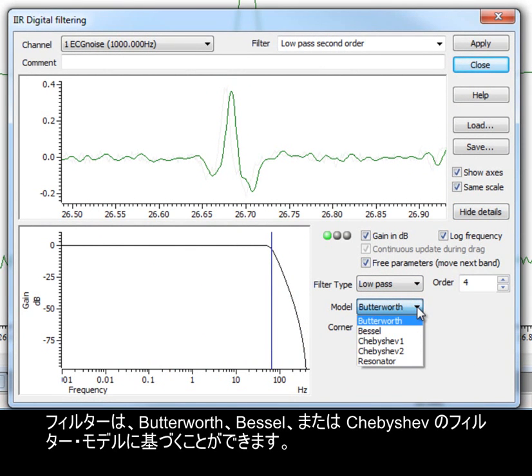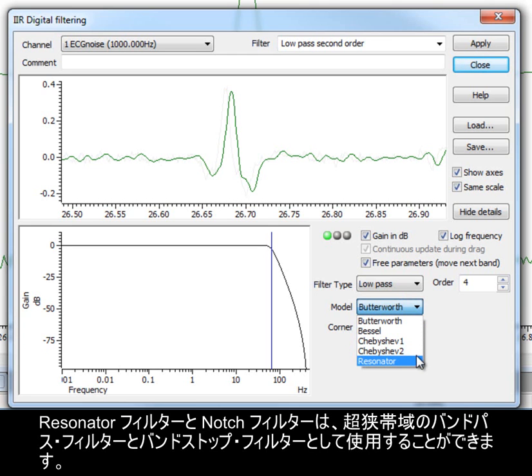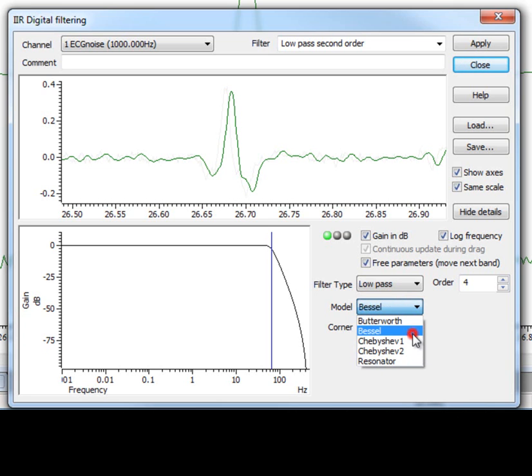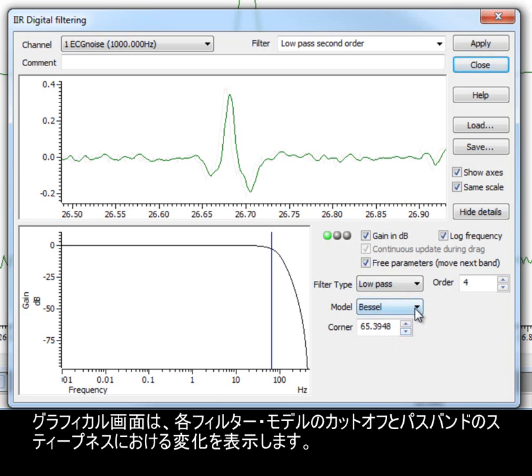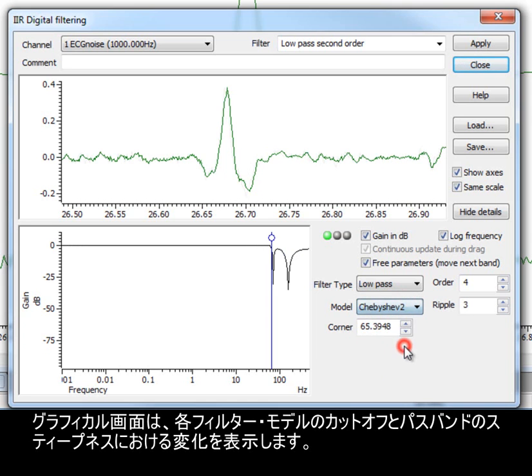Filters can be based on Butterworth, Bessel or Chebyshev filter models. Resonator and notch filters can be used as very narrow band pass and band stop filters. The graphical display shows the changes in the steepness of the cutoff and the passband for each filter model.